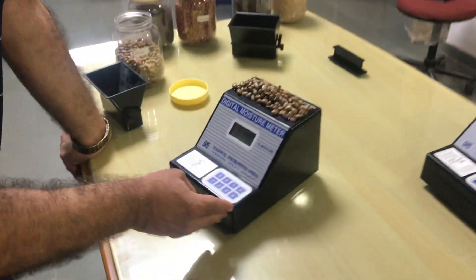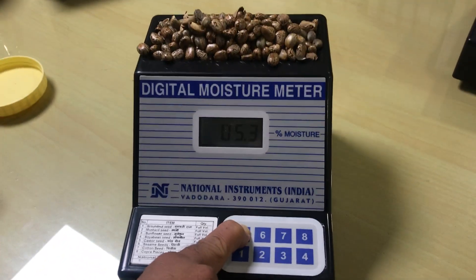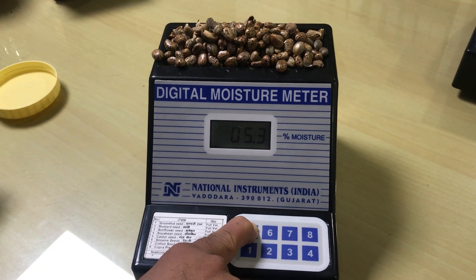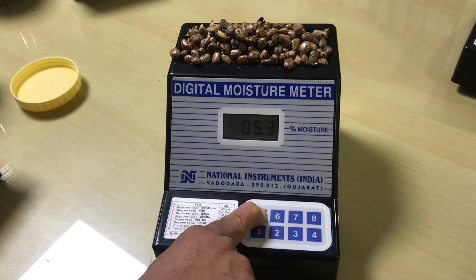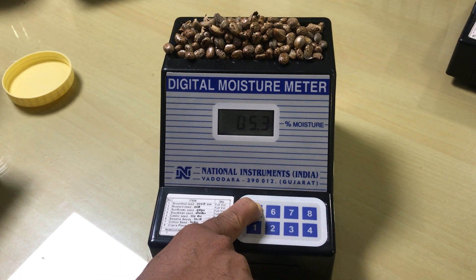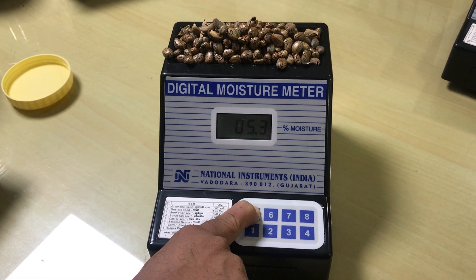The number 5 key is calibrated for castor seed. If you press the number 5 key, it will indicate the moisture content in the castor seeds. Right now it indicates 5.3% moisture in the castor seeds. This is very dry castor seed.